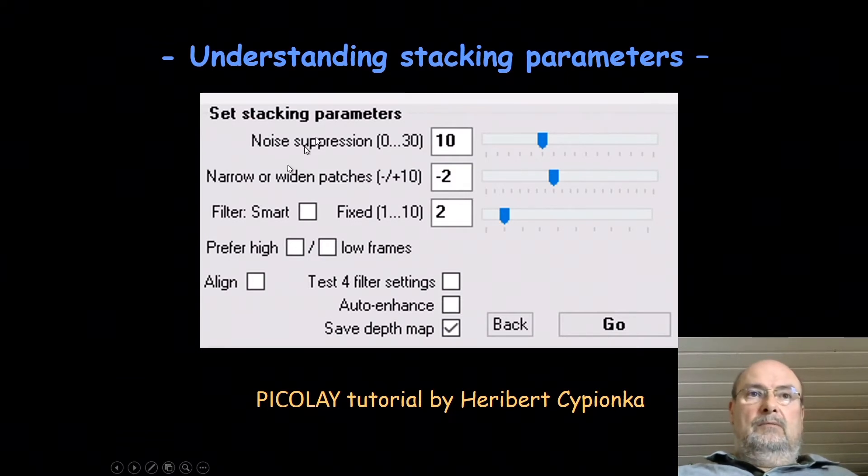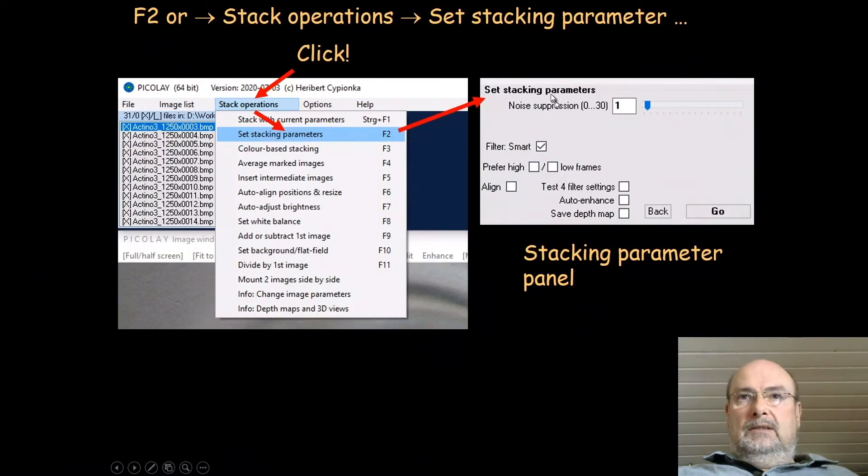There are a number of parameters listed and we're going to look at them step by step. To find the stacking parameters, go to Stack operations, Set stacking parameters and you get this panel. Or you can simply press the F2 key. In the beginning not all parameters are listed, some are inactive and not shown to keep it as simple as possible.